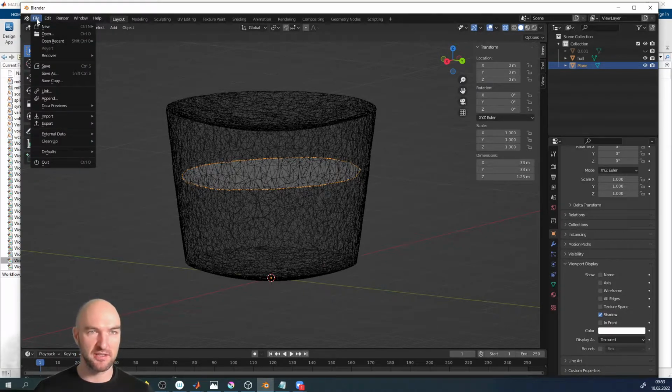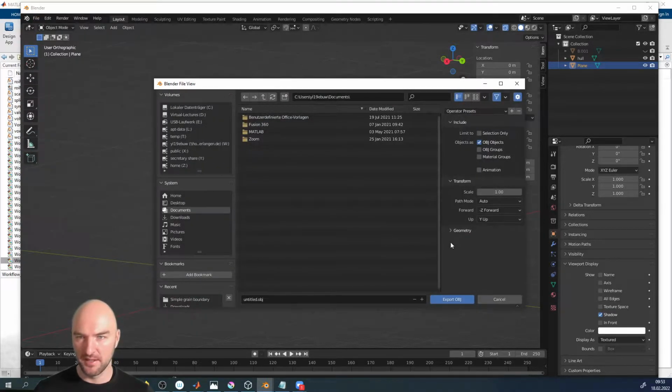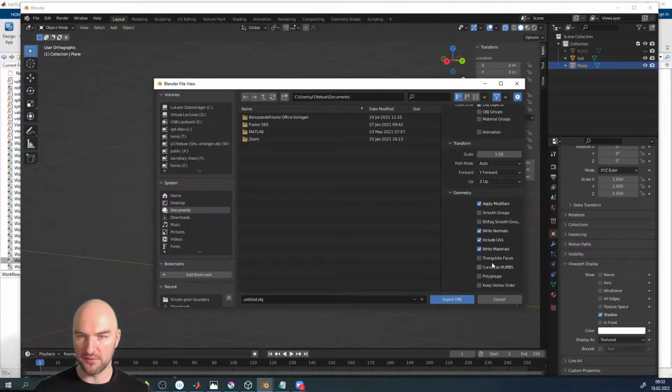Just like I showed you yesterday, click on File, Export Wavefront OBJ. We want our selection only, and we want Y to be forward and Z to be up, and we want triangulated faces, no materials, no normals, and no UVs. And later on, we're also going to use polygon groups, but that's not something we're doing right now. Right now, we're only going to work with triangulated faces and our selection here, and a scale of 1, obviously.